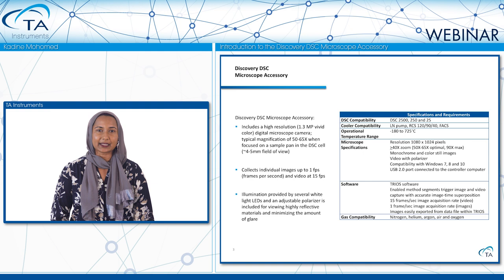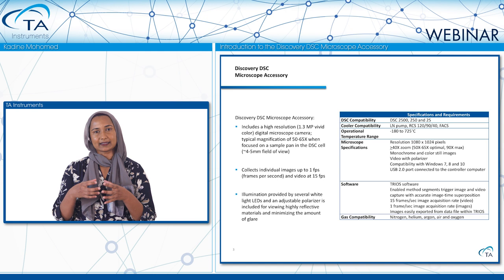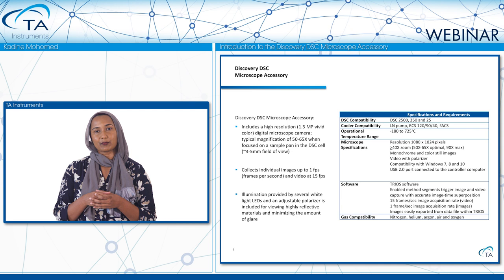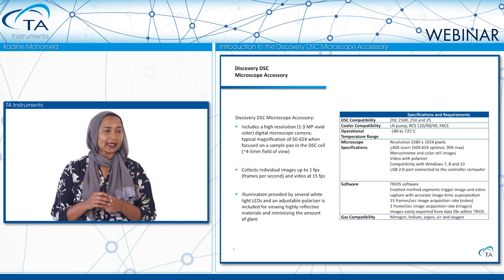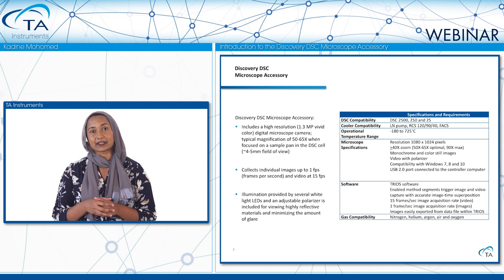Before we go into the applications, let's review some of the specifications of this accessory. The Discovery DSC Microscope Camera has a high resolution of 1.3 megapixels. When looking at the sample pan positioned in the DSC cell, with a field of view of approximately 4 to 5 millimeters, the magnification obtained is approximately 50 to 65X. This accessory allows you to capture video and images simultaneously, and there is an adjustable polarizer to minimize glare from reflective aluminum pans or reflective samples.